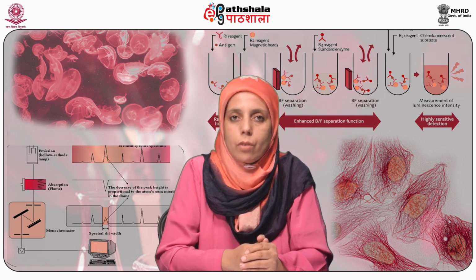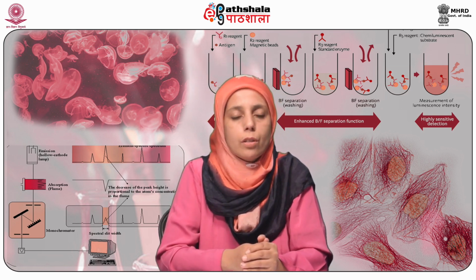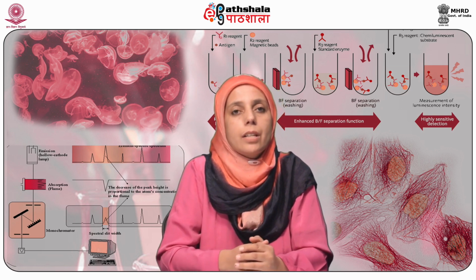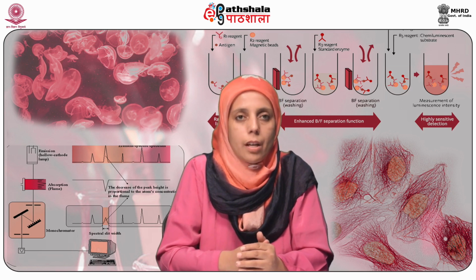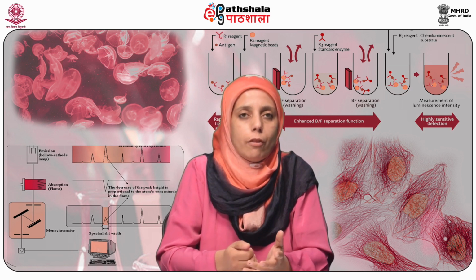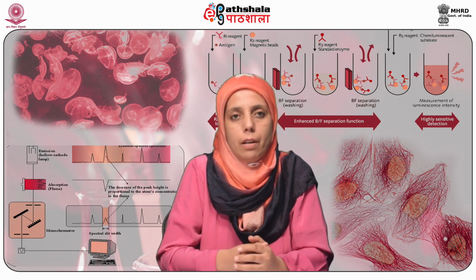One is the intrinsic structure of the molecule, that means factors which are due to the intrinsic properties of the molecule, which arise from the structure of the molecule. And second is extrinsic factors, which arise due to the environment of the molecule. In a way, when you record fluorescence in solution, the solution becomes the external environment.